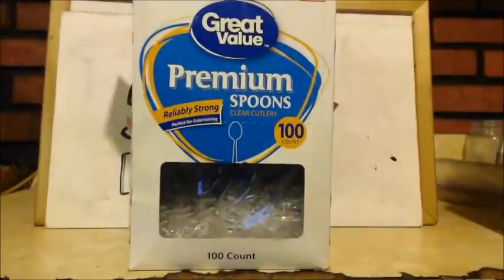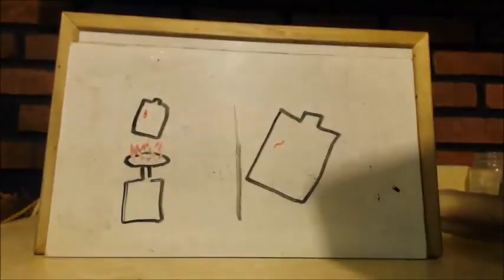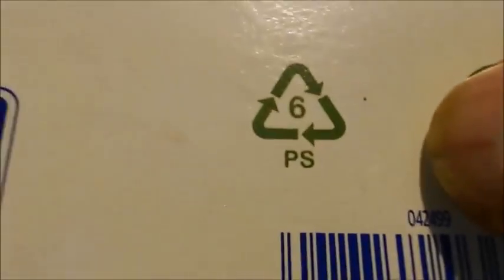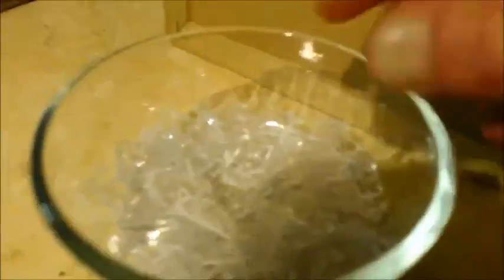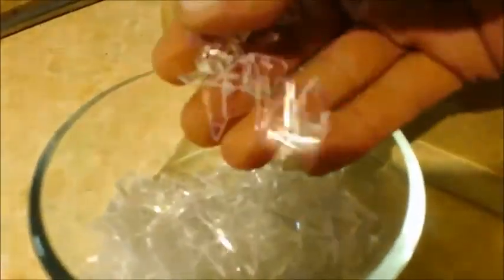Okay, this is what I got. I used spoons and knives and stuff like that. So I get a look at that code. PS Polystyrene and the number 6, always with those arrows around it. See there? As you can see, first of all, I'll cut them up into small pieces. Tiny.